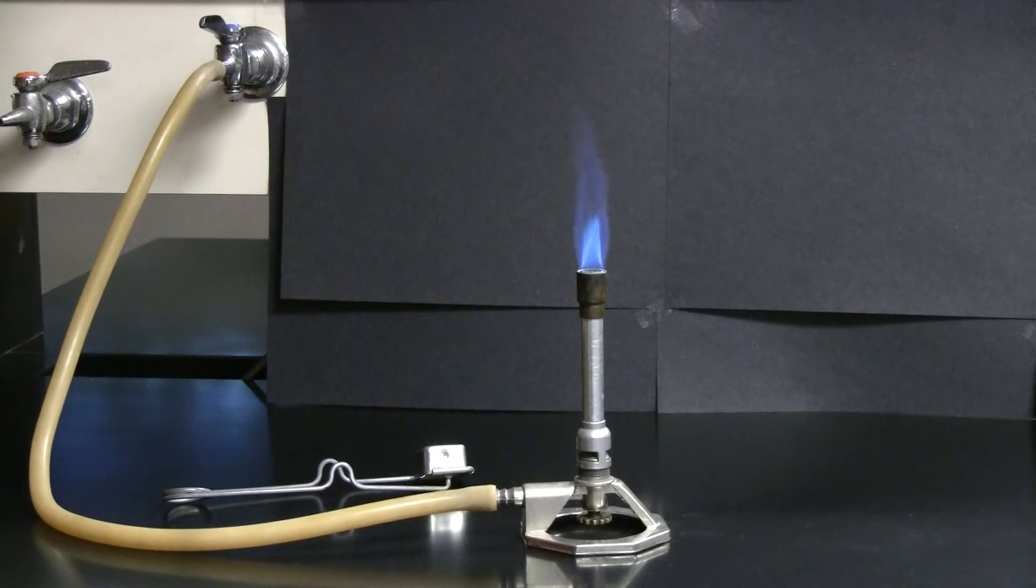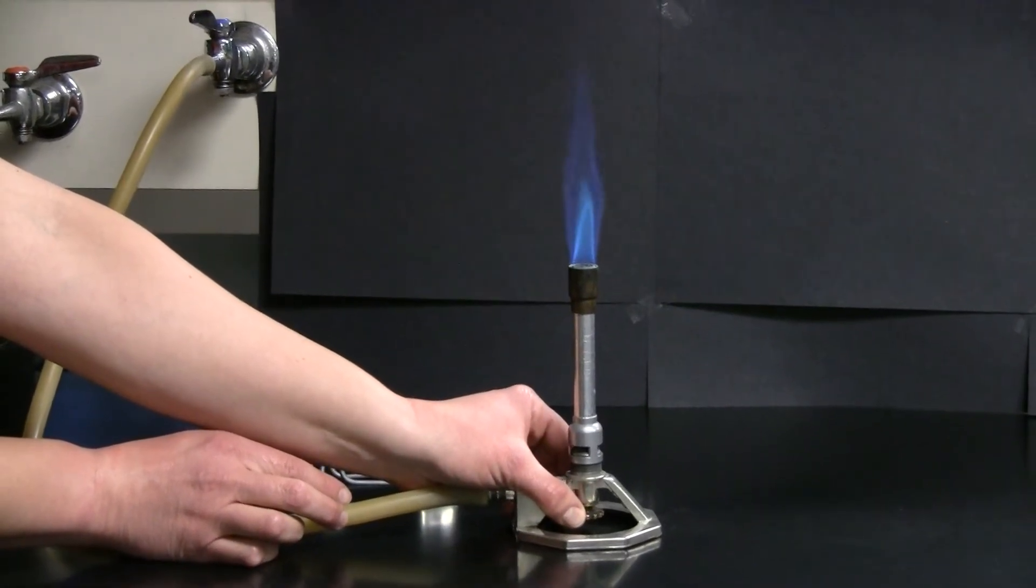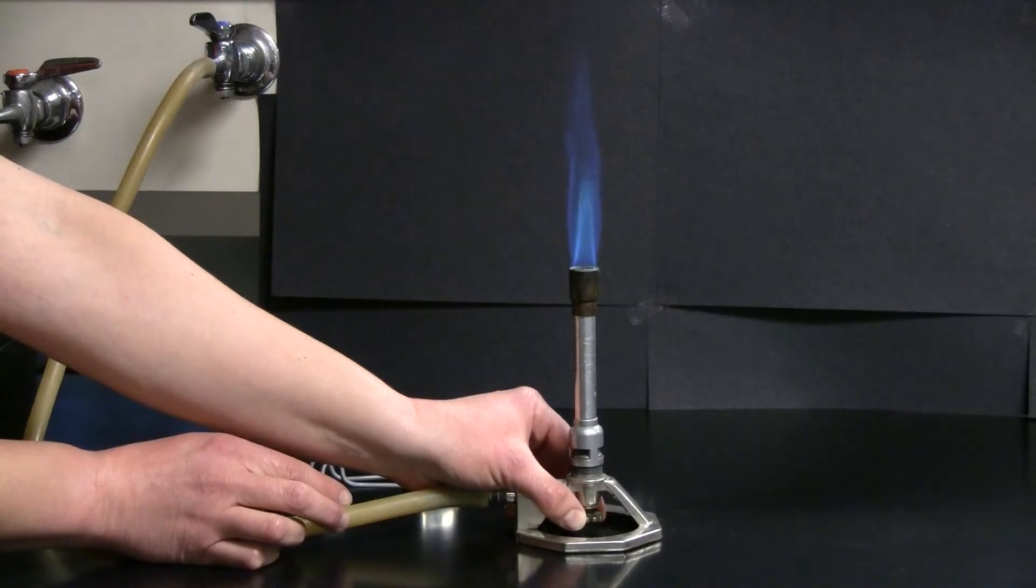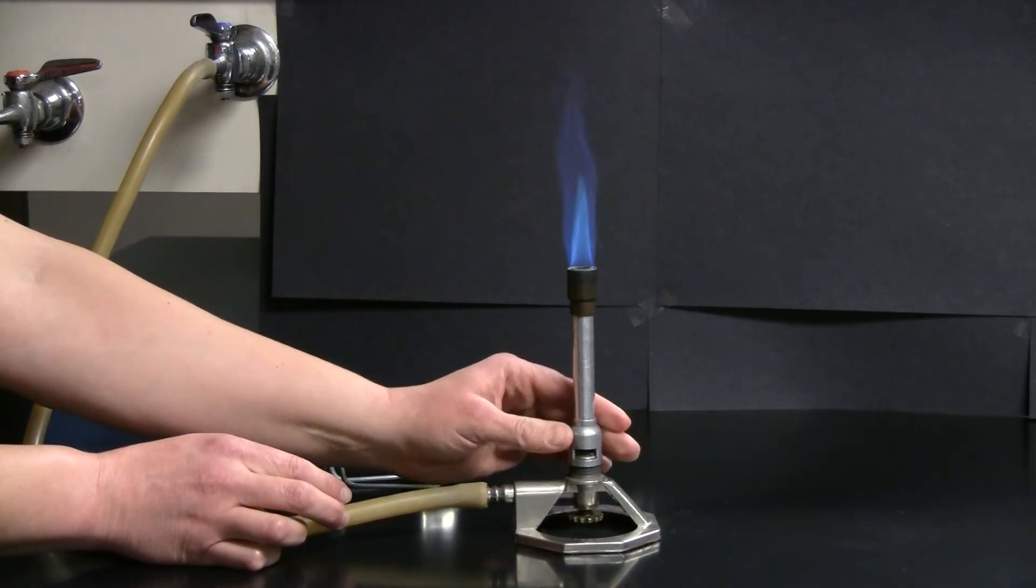If you want to make the flame larger, use the gas inlet valve at the bottom to increase the amount of gas. You may need to also adjust the air inlet valve to get that good strong sputtering flame.